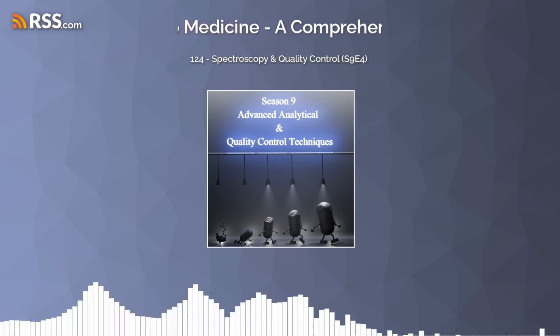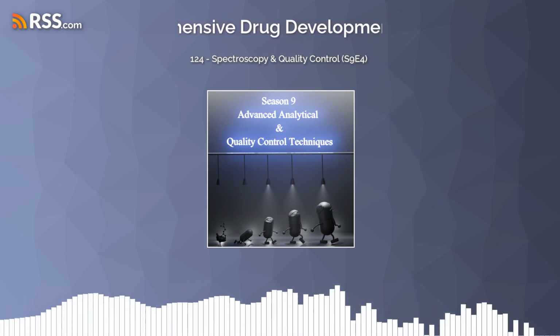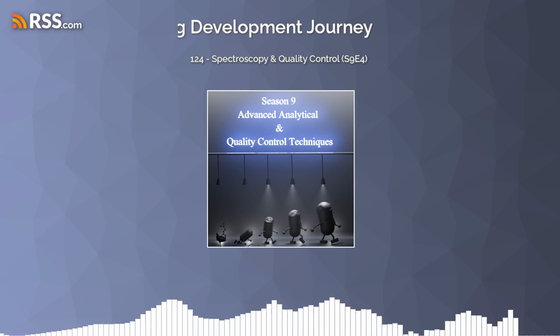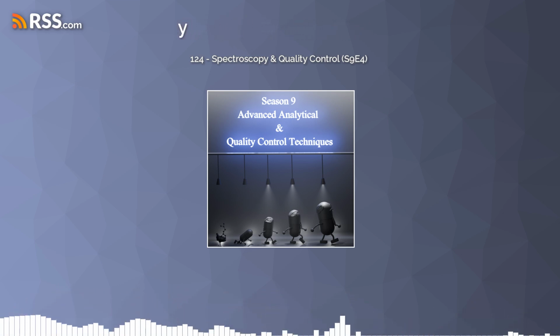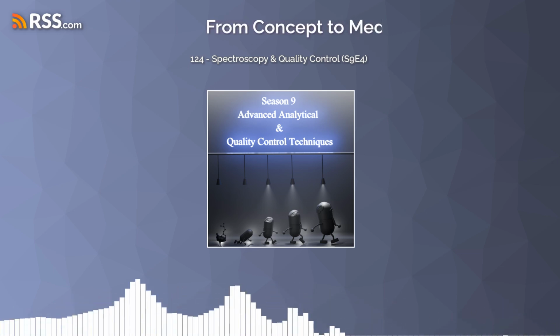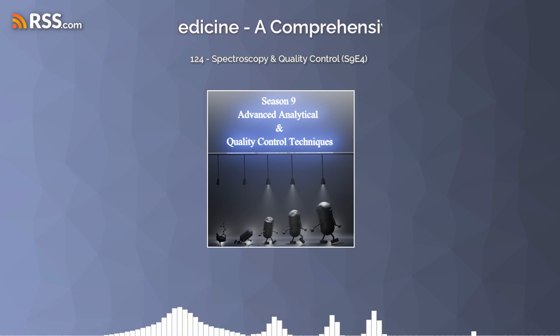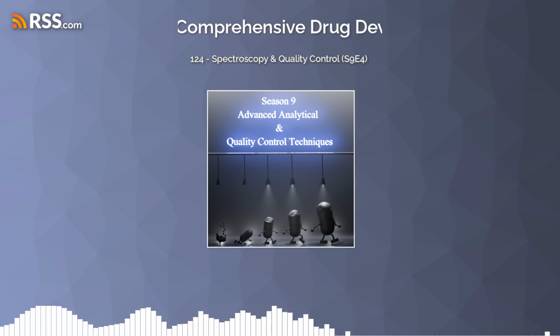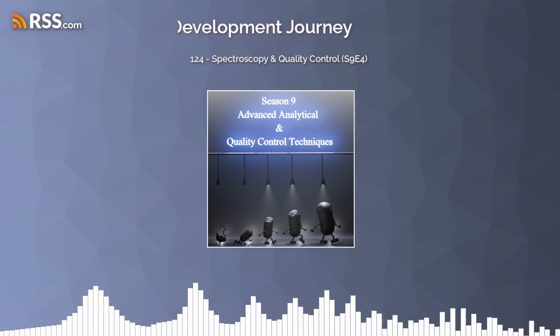Right. So we do that by comparing the spectrum of an unknown sample to a reference standard. The reference standard is basically a known pure sample of the thing that you're trying to make. And so if they match, you're good. You know you have what you're supposed to have. And that's super important, it's absolutely critical, for making sure that the drug that ends up on the shelf is actually what it's supposed to be. You don't want any mix-ups, right?